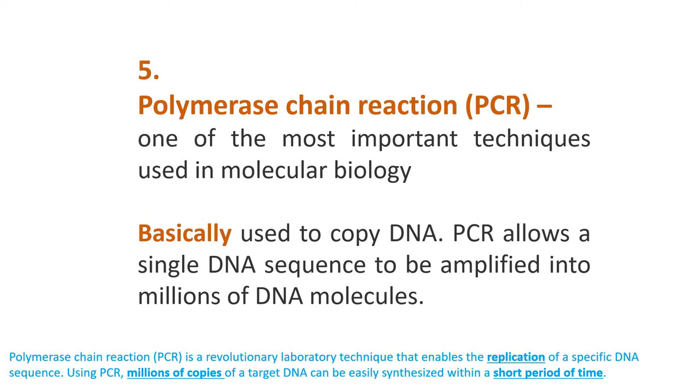الاذر تكنيك اللي هي صدد محاضرتنا اليوم it is the polymerase chain reaction اللي هو يسموه PCR واللي هو most of the important biological techniques or molecular techniques used in biology. Basically we are using the PCR technique to copy the DNA strand for example or target part of DNA by using this PCR which allows a single DNA sequence for example sequence of basic nitrogen molecule to be copied and amplified many times for example millions of copies حتى أني أخذ هذا السامبل وأسوي له further test حسب إذا كان forensic medicine أو إذا كان detection of bacteria or virus and so on.